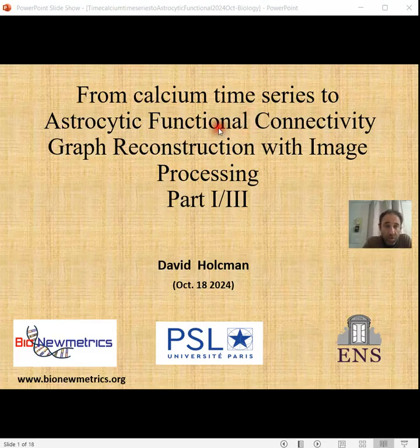This is the first YouTube video of a series of 3 about calcium time series and how we can convert the time series that are recorded in, let's say, a slice with a confocal microscope to extract from this time series correlation that would lead to a graph representation and a better representation that will allow us to extract statistics of the underlying network.